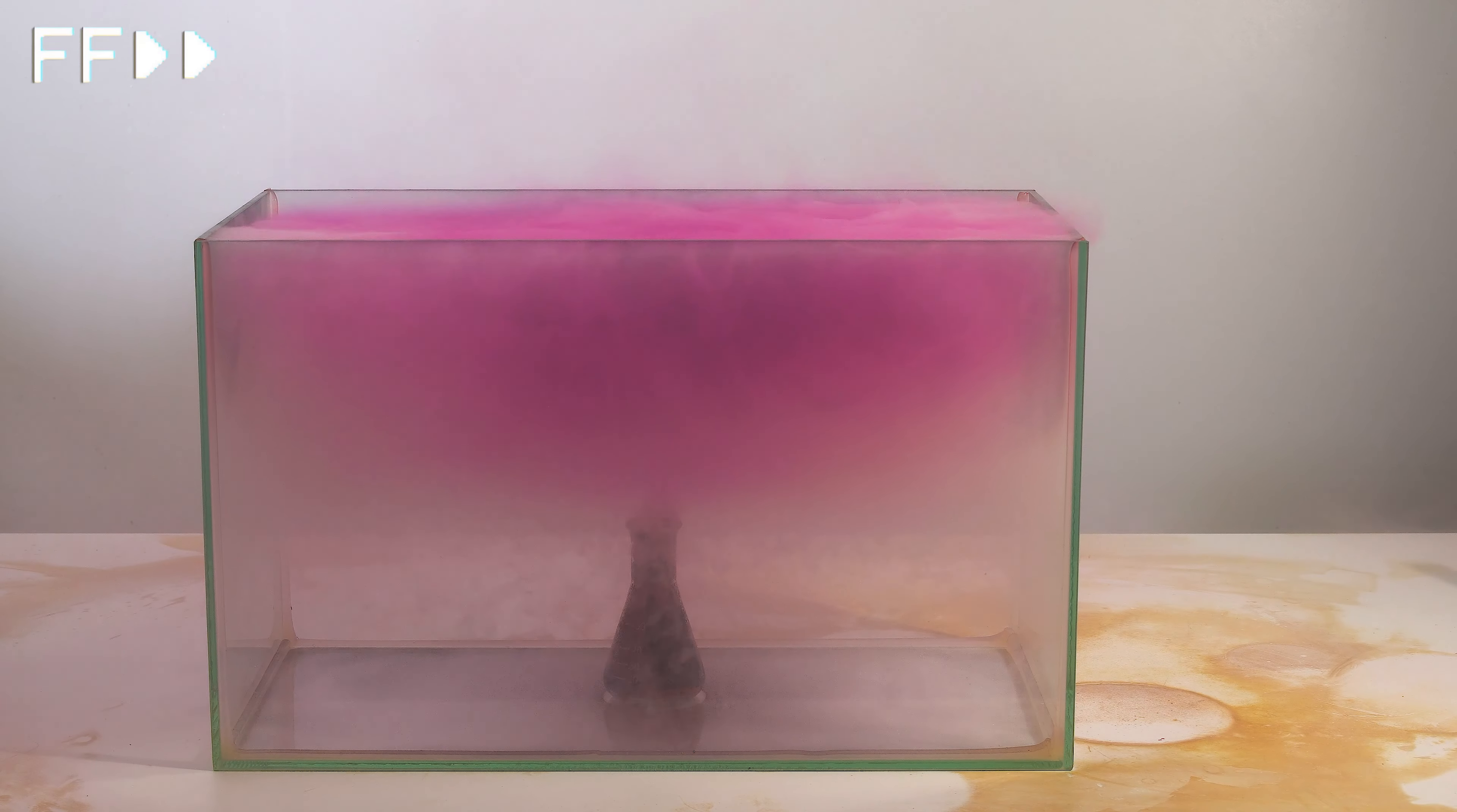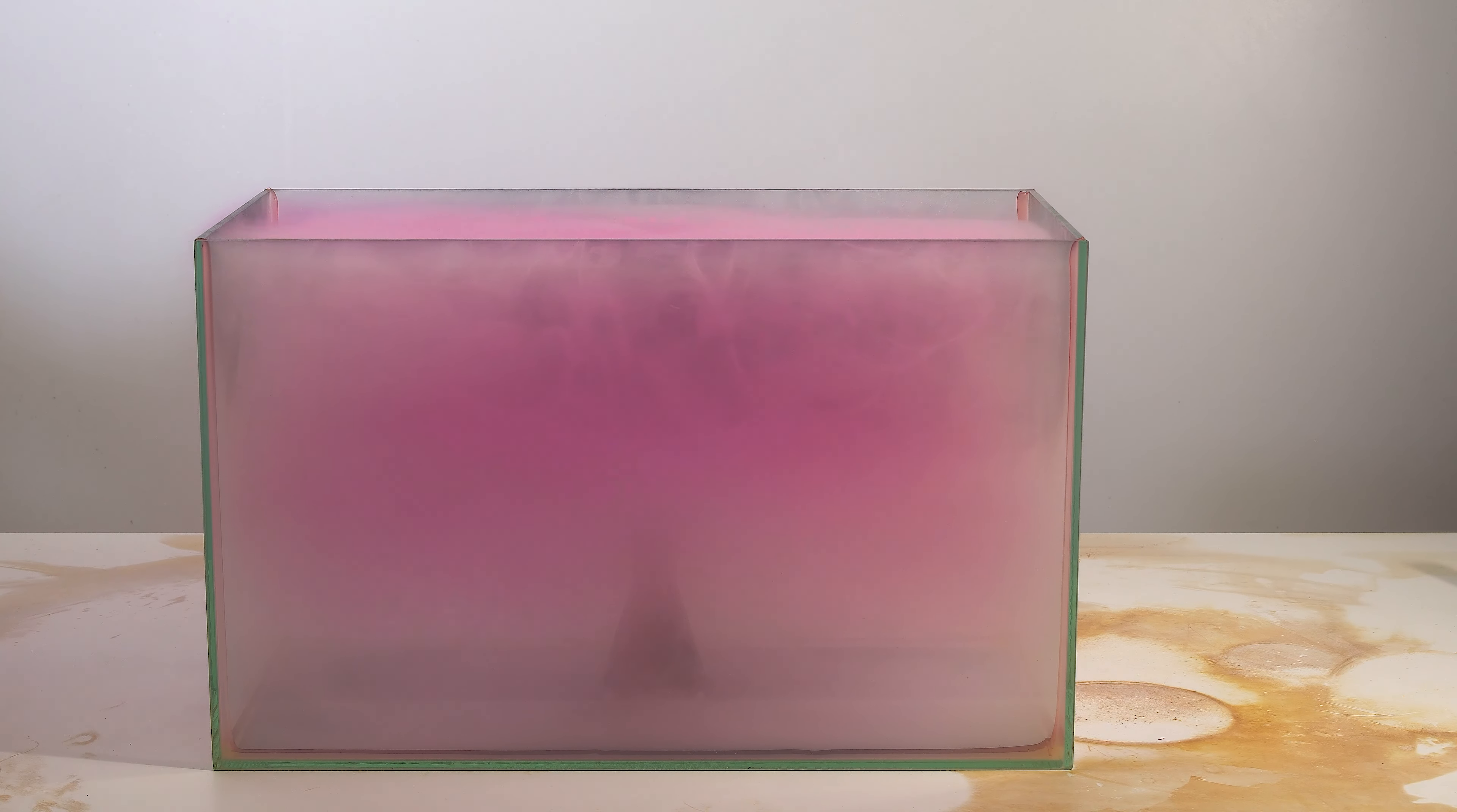And diffusion is the only reason the glass box is eventually filled with iodine vapors.